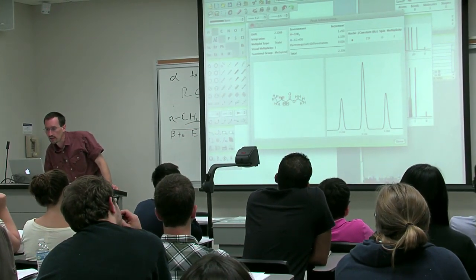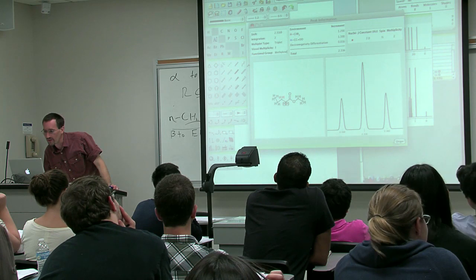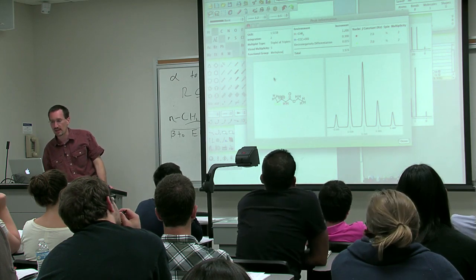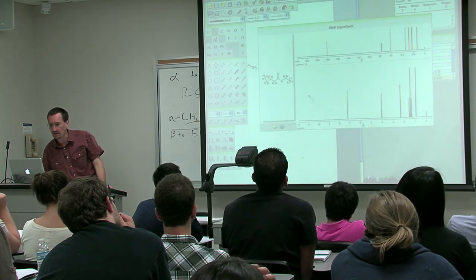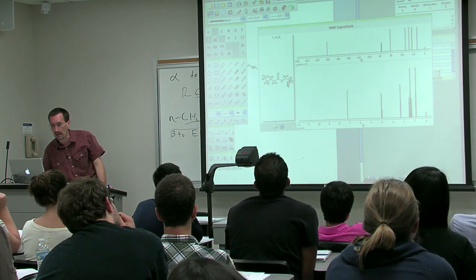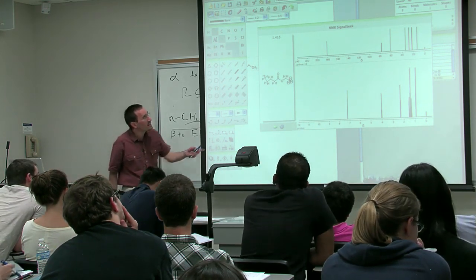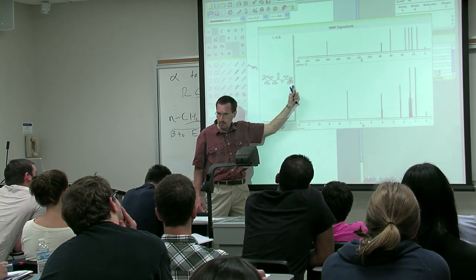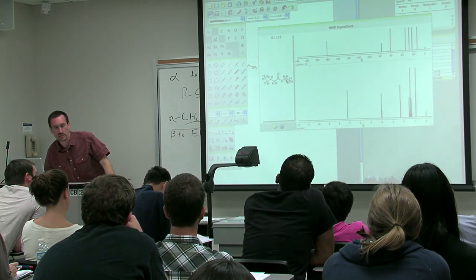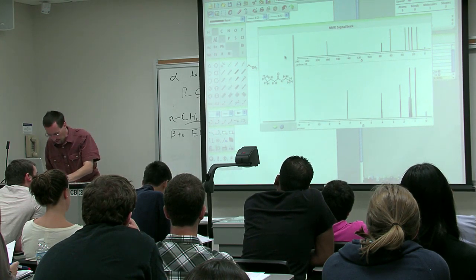And if we click on each of these, you have to do it for each one. If I do this one, it's estimating it at 1.5. And of course, you don't have to click on it, you can just highlight it. This is 1.3. This is 0.9. This is 4.01. This is 1.4. So it is essentially doing exactly the same thing that we've done, and the same for the C13 NMR shifts, for example, the carbon that's next to the oxygen. That's a handy tool, as is Pretsch.